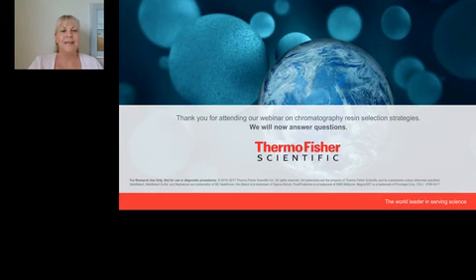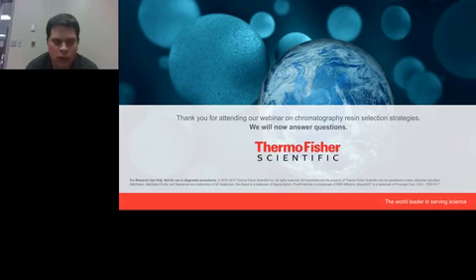Thank you so much for that answer. And we'll wrap up with one more question for Scott. You had a slide showing magnetic agarose had higher yields compared to non-magnetic agarose for Ni-NTA and glutathione small-scale purifications. Can you elaborate on why the magnetic agarose beads have better recovery?